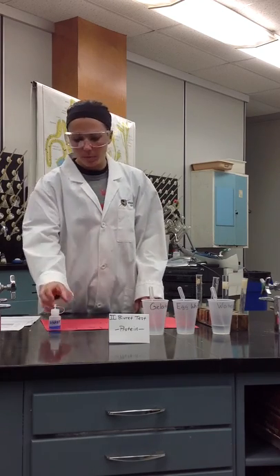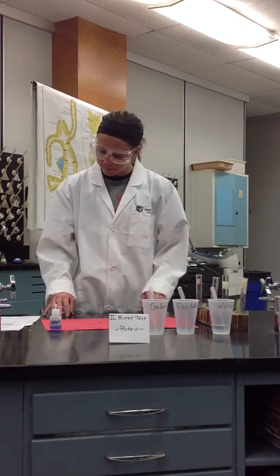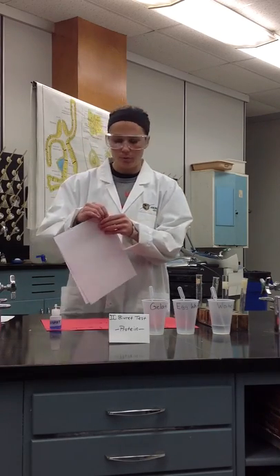In this experiment, we're going to be using biuret in order to test for protein. You're only going to need 3 of your test tubes, but you can still leave the 4th one in your test tube rack. If you go to your lab procedure sheet, you should be looking for exercise 2.